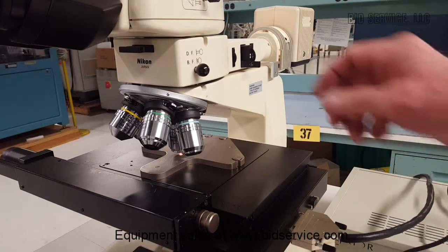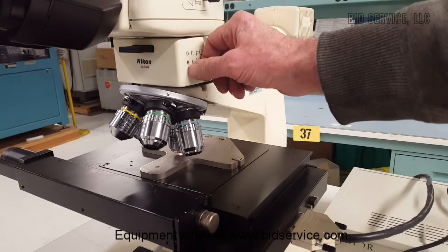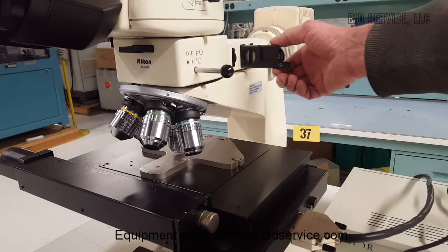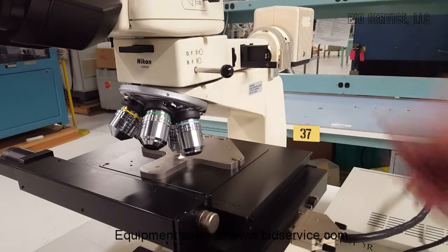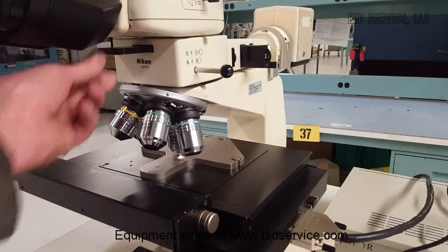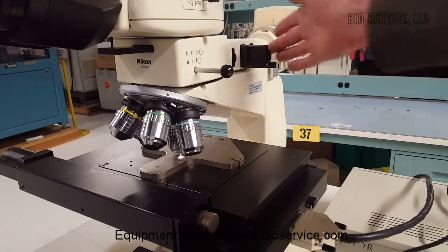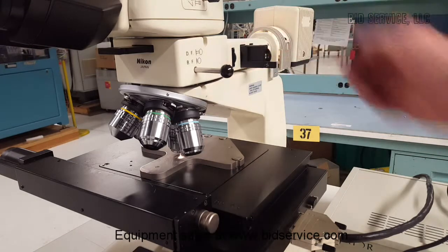Now, for dark-field operation, pull this out. You'll want to pull out the polarizer and the analyzer, because dark-field needs all the light it can get. Open your aperture all the way, and your field as well.